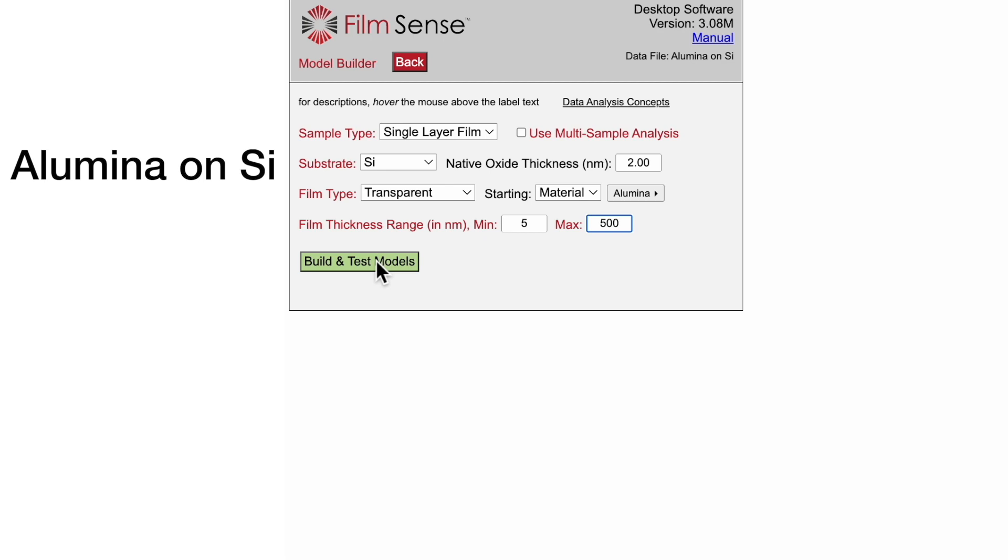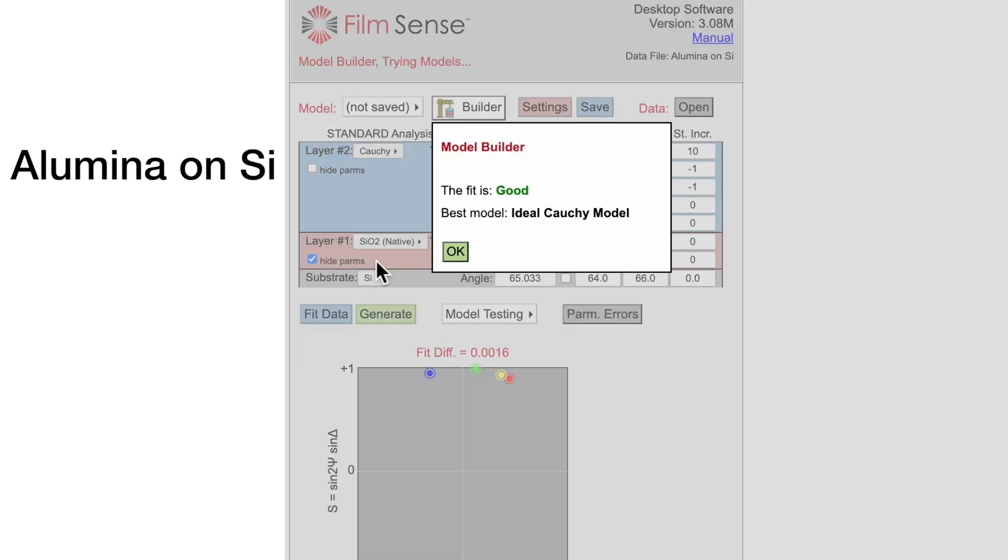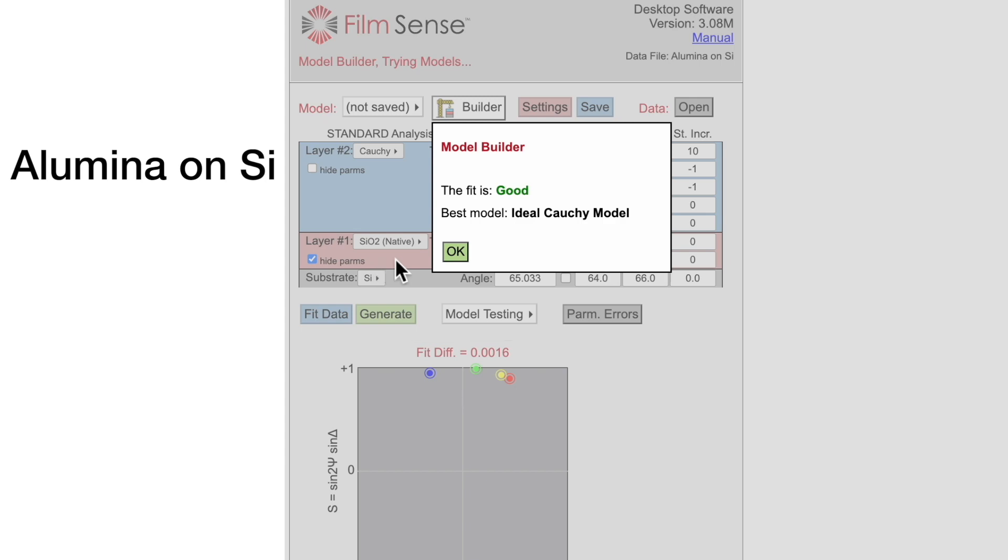Now we are ready for Model Builder to do its magic. Click the Build and Test Models button, and Model Builder suggests that the fit is good, which means that the fit diff is acceptably low, and the best fit model is an ideal Cauchy model.